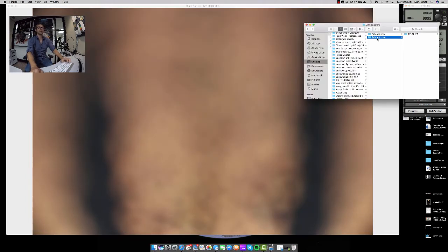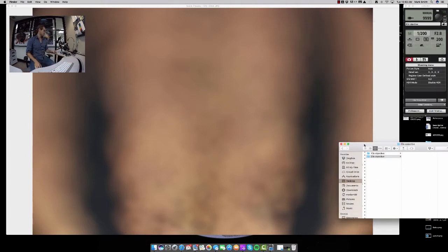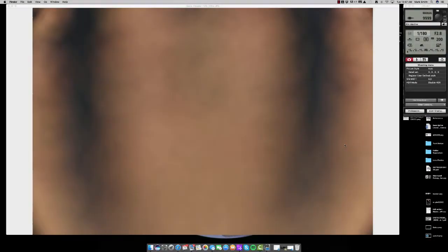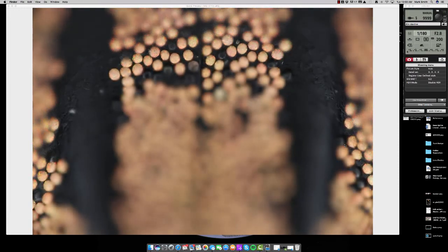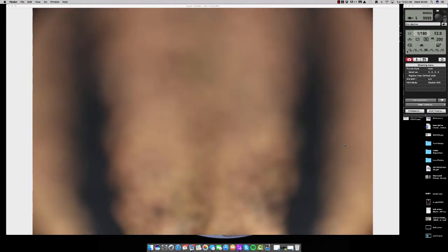So we're going to go back to our 20x objective folder and delete those test images. From there, we're all set up — we're going to be capturing 150 images. All I need to do is press start on the controller and it's going to move along and capture 150 photographs. I'll speed up the picture frame, and then we'll come back and proceed once these images are finished being collected. Now we can stop the stack shot because we can see that the focal plane has moved all the way through the subject.